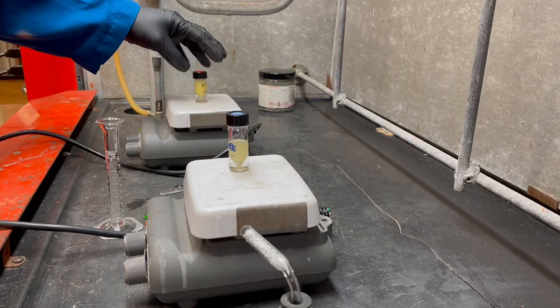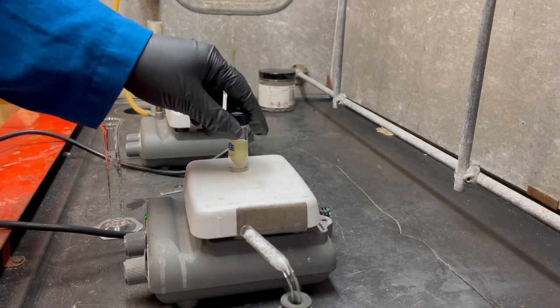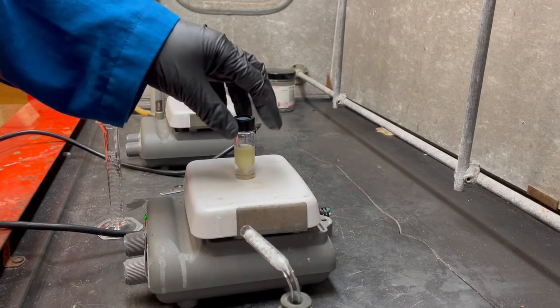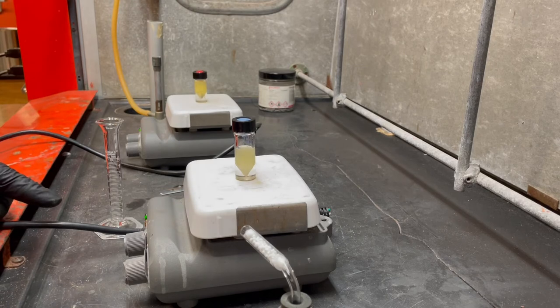All right, so I actually went ahead and started another batch. I'm not necessarily gonna work this up, but there is a point where we can kind of tell if the desired product is forming, and so that's probably when I'll stop bringing both reactions forward. I just wasn't too stoked about the color change on this one. It was really yellow and then it went away because I was adding so slowly, and I feel like it's just really humid in here and it's causing the sodium ethoxide to be quenched by the water in the atmosphere. That will pose an issue and we do not want that. So we got two batches going. I'm not giving you both numbers though.